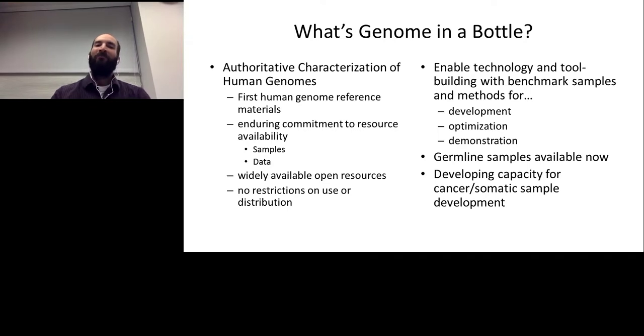We really try to enable technology development and tool building by disseminating these benchmark samples, and this has been used in development of new technologies, in optimization of new technologies and bioinformatics methods, and then to demonstrate the performance of these methods when they're released.